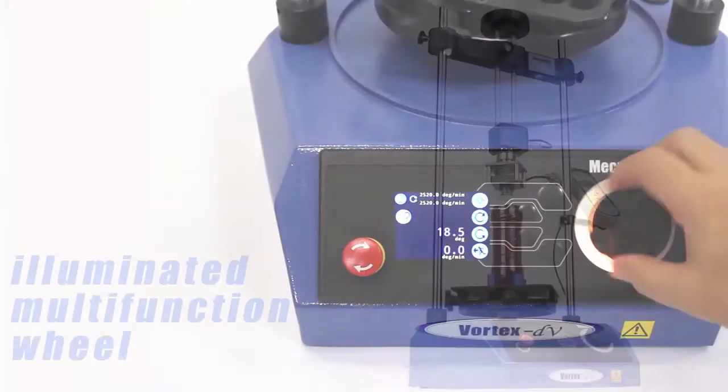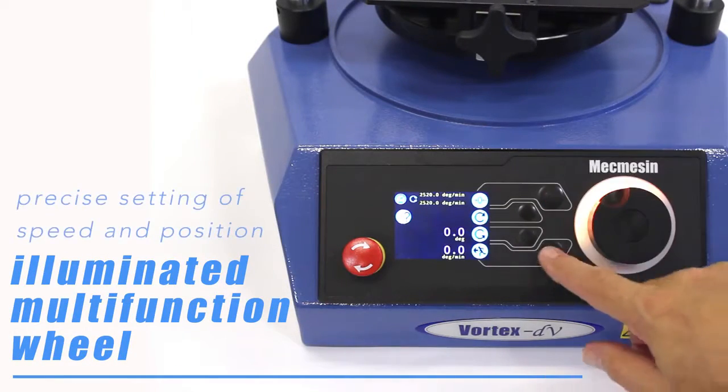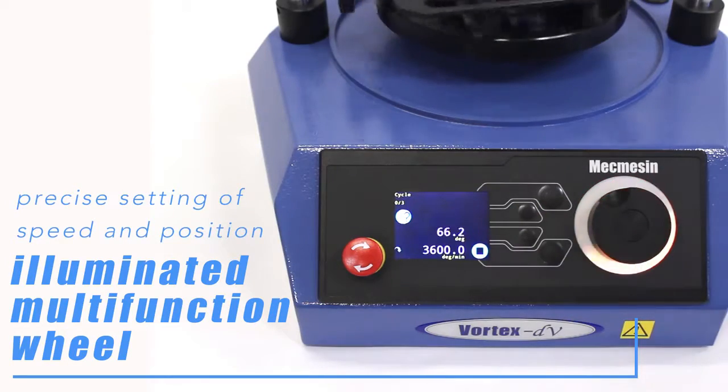The illuminated multifunction wheel is used for precise setting of speed and position. It's also used to accurately adjust the position of the sample before testing begins.